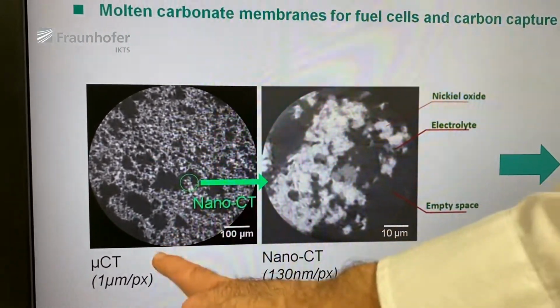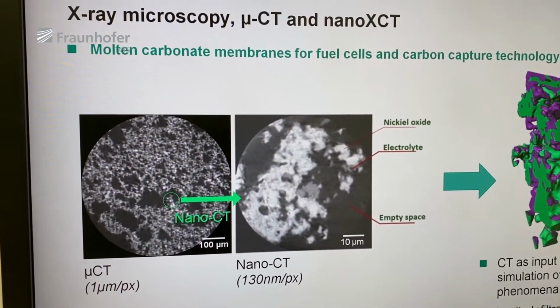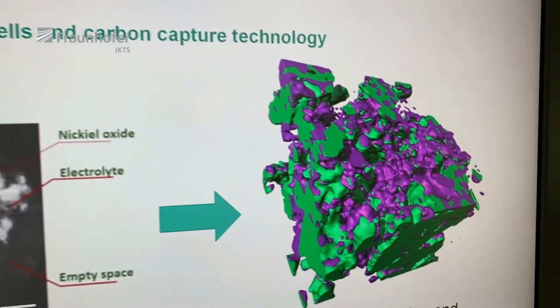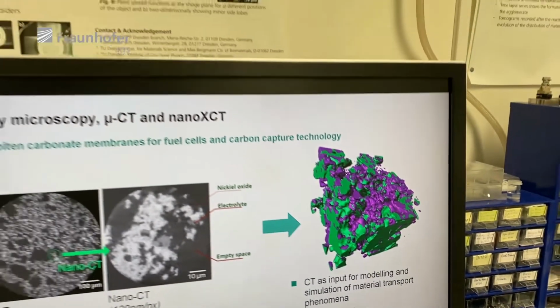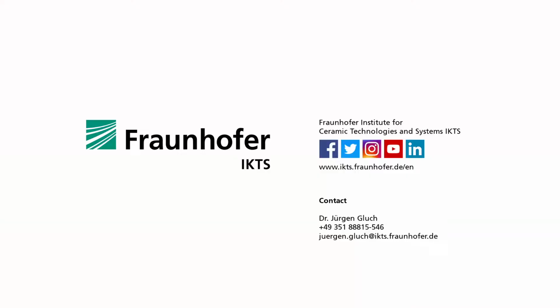And we combine this data with lower resolution data from micro CT, and all together we can form data for simulation, so for FEM simulation in the end. This was my short introduction to X-ray microscopy in the Fraunhofer IKTS.